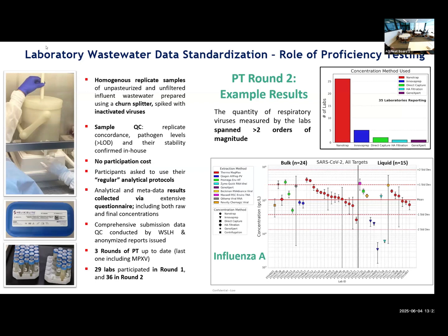We're also trying to understand the variability of these methods. If we have enough information on exactly how you do your replication, what exactly is the result you're providing me? Is it a mean of your PCR replicates? Is it a mean of PCR replicates that is also done on, say, full process replicates? So at the end, is it an average of 9 data points, or 2 or 3? If we can understand that, we can also learn more about the largest source of variability in the method, and other things, hopefully in the future. And I'll stop there.